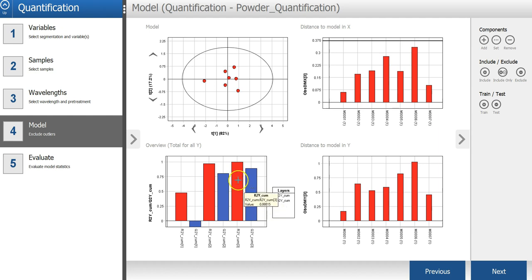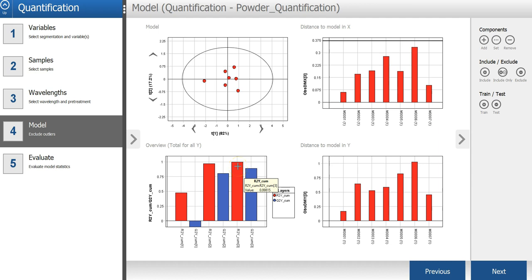And the Q-square, the blue bar, is showing the prediction from cross-validation. Using these three components, the R-square is around 0.99 or almost 1.0, and the Q-square is around 0.89. So this is indicating a very good model.